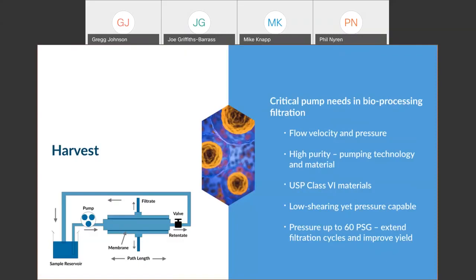The trick in tangential flow filtration effectively is to regulate both the transmembrane pressure and cross-flow flow rate to prevent membrane fouling. This allows a greater volume of product to be processed in the least possible time. Peristaltic pumps are needed in filtration to provide the mechanism to push fluids through the filtration apparatus.